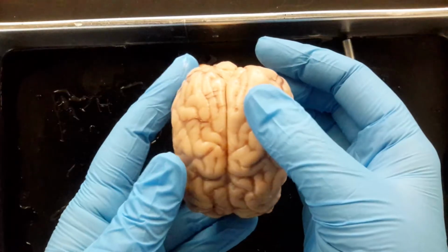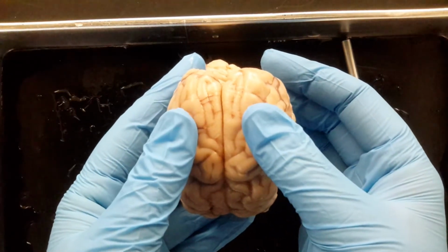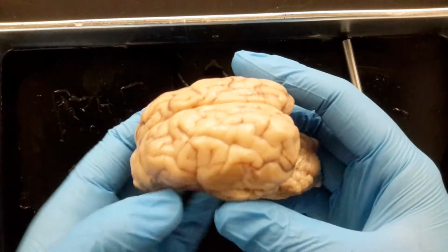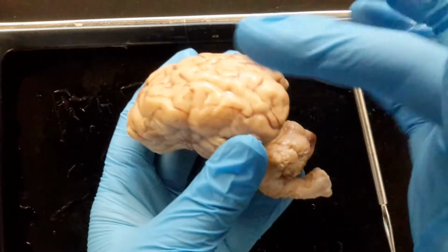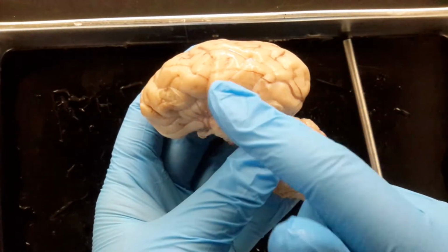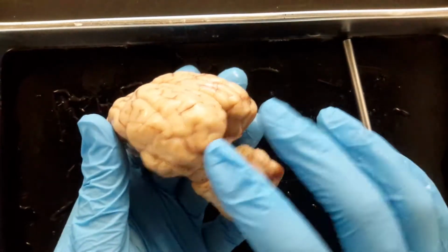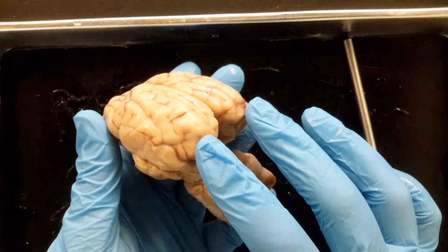Okay, behind the frontal lobe, kind of on the top sides, I know it sounds kind of silly, are your parietal lobes. So let me turn this, guys. Some of these are mushy, just do your best, okay? So frontal lobe, parietal lobe is going to be above. Below the parietal lobe is where you're going to have your temporal lobe. Kind of imagine this is where the ear would be, okay? And then the back portion, the posterior portion, is going to be your occipital lobes.